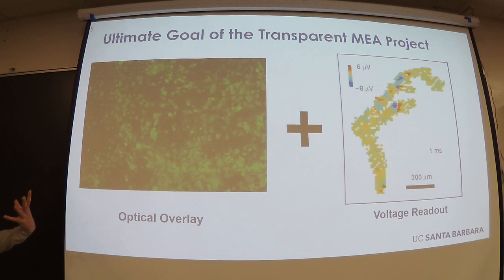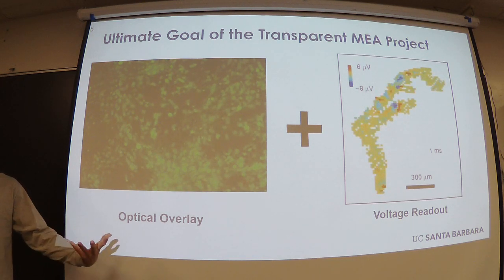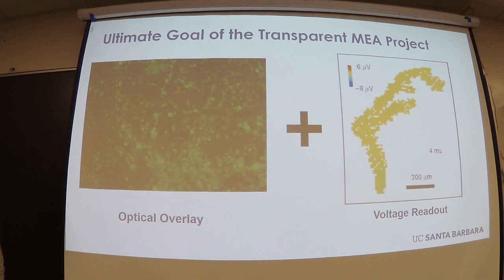and cover each other's bases, because there are aspects of using the electrode arrays that introduce biasing, where certain electrodes are going to have neurons or cells on them, and this means that you're going to have many more electrodes than cells. And so you're going to pick out the electrodes that have cells on them, and you might overestimate the prevalence of some of the factors that you're seeing in your culture. But if you have these imaging techniques, you're less likely to do that. So by combining these two things, we can get a more accurate picture of the culture that we're hoping to study.